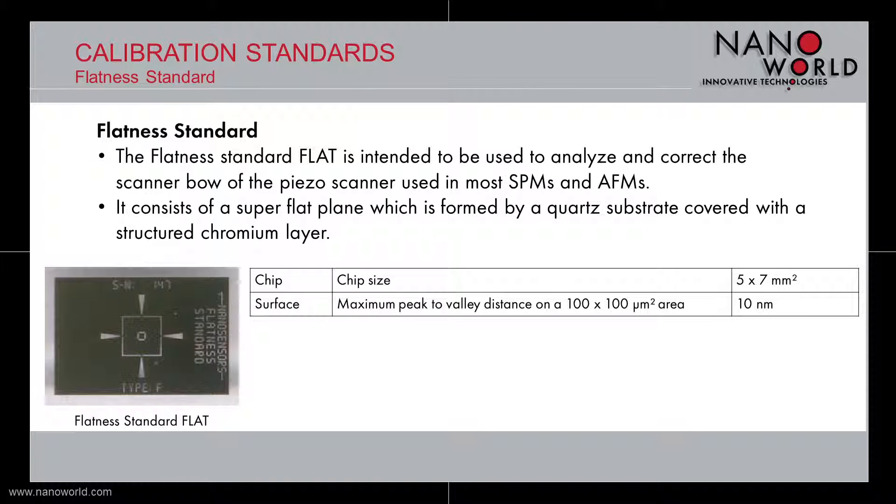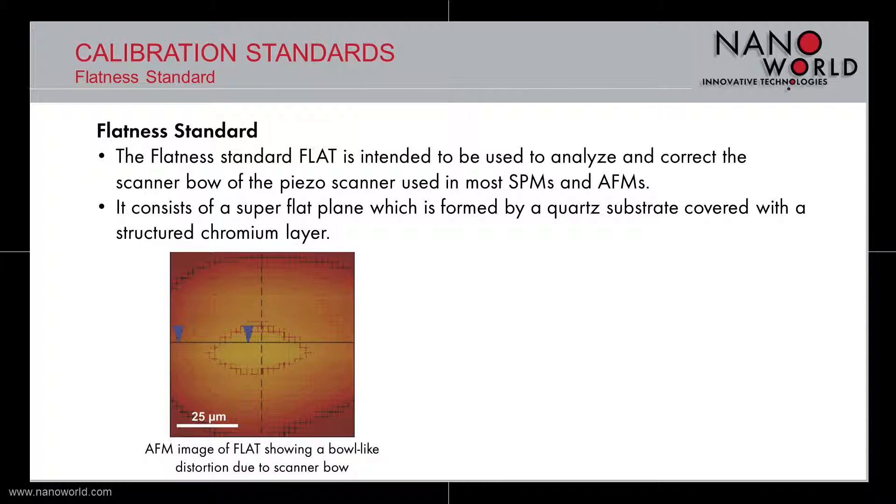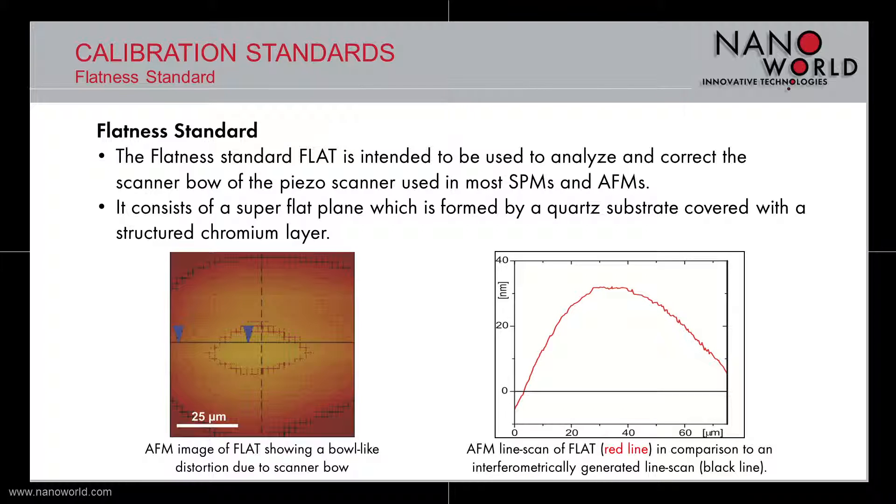The maximum peak-to-valley distance on a 100x100 μm² area is 10 nm. On bottom left you can see an AFM image of the FLAT calibration standard showing a bow-like distortion due to the scanner bow.